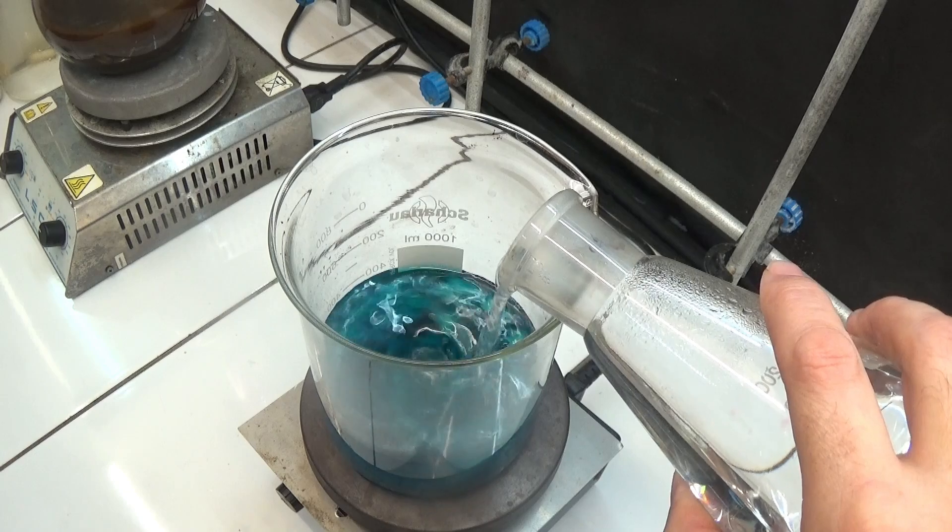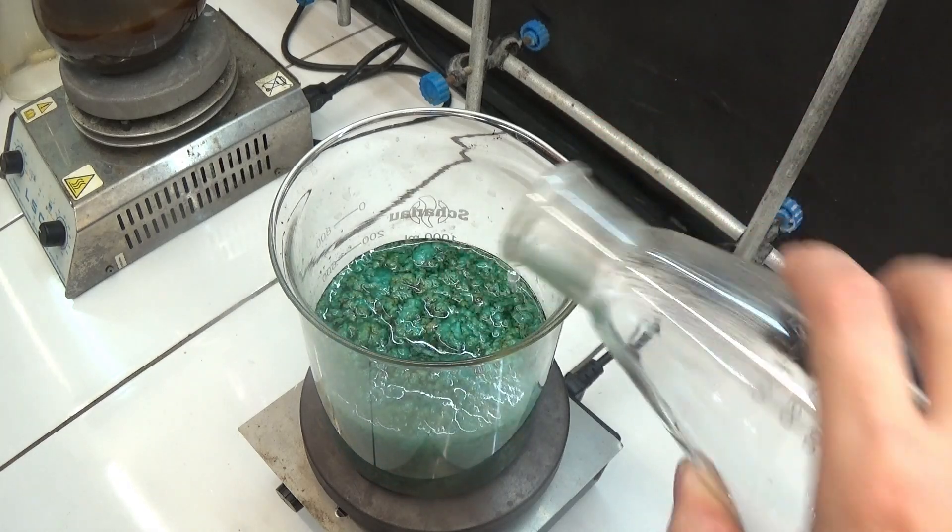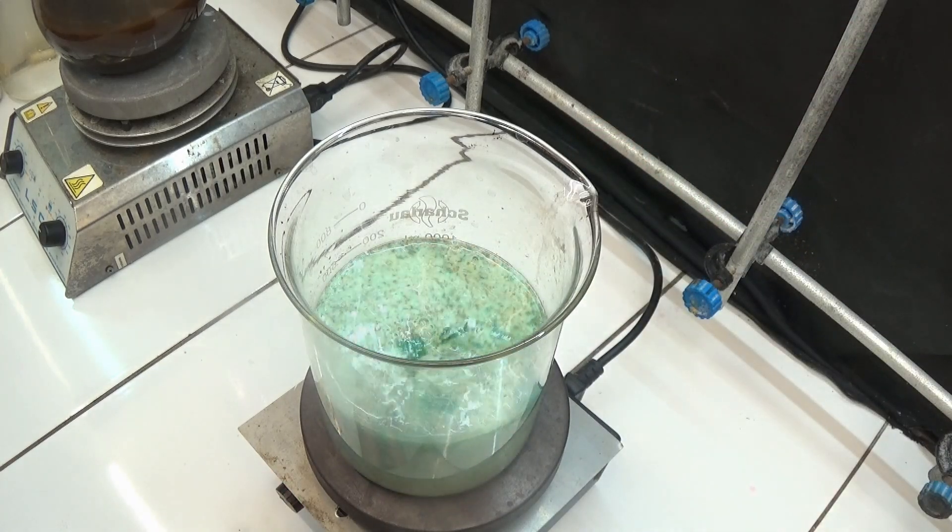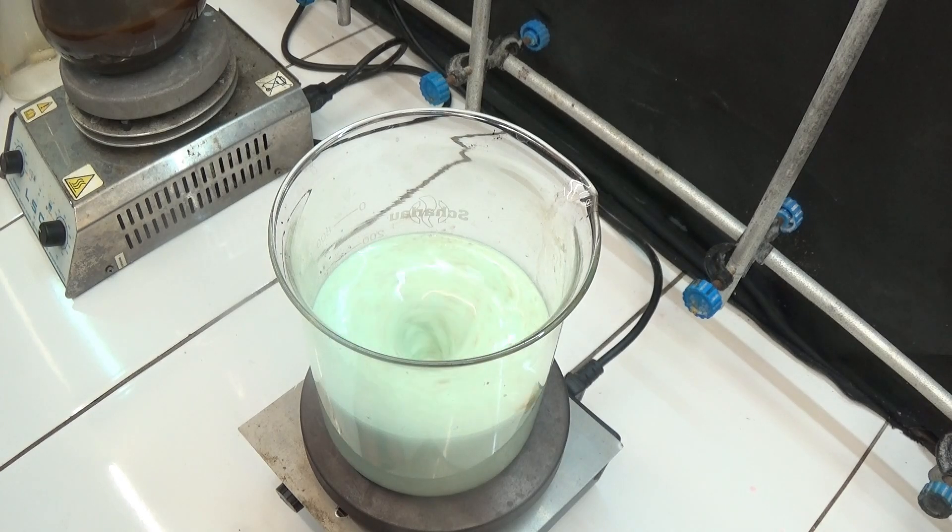Add the sodium hydrogen sulfite solution over the copper sulfate solution, stirring slowly. A precipitate of white color is formed. This is the copper chloride.